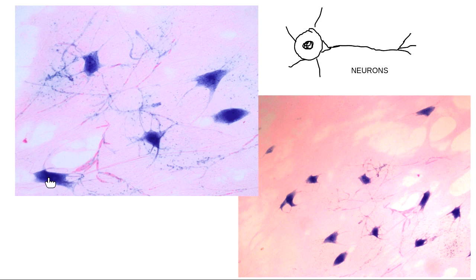But if you look on here, you can also see, especially on this particular slide, see all these little dark blue spots. These little dark blue spots that you're seeing here, their names, they're called neuroglia. Neuroglia are helper cells. So again, we'll talk more about this in unit number 3, but neuroglia are not thinker cells.